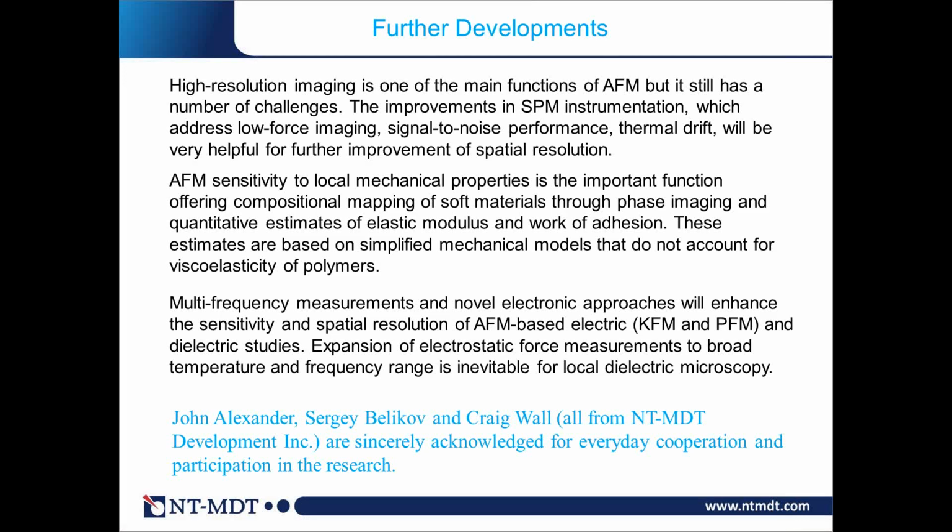We have a strong feeling that the only way to get the true shape and dimension of the cantilever is to go to the SEM or TEM. And then this is the QNM. A big part of QNM was reconstruction of the tip shape from TEM data. People are forgetting that QNM is not just getting the results and analyzing the formulas, but doing a lot of preliminary work, which actually justifies the final results.